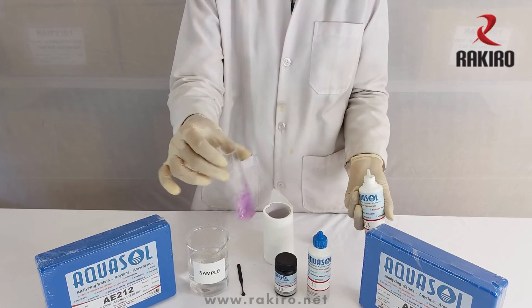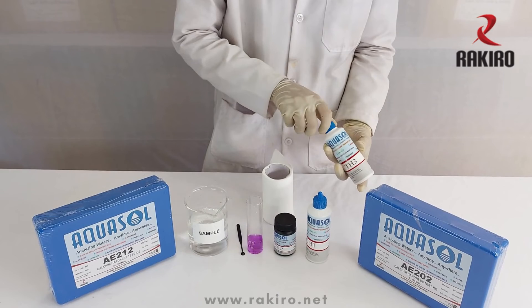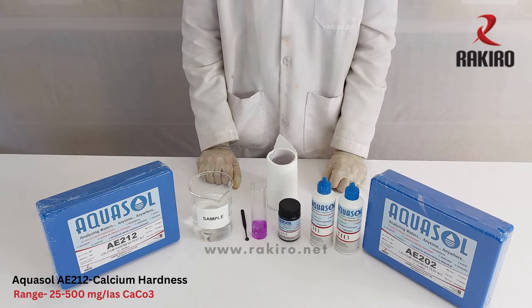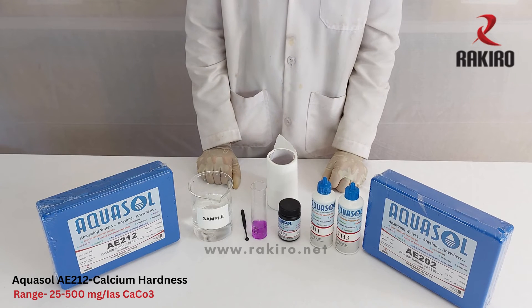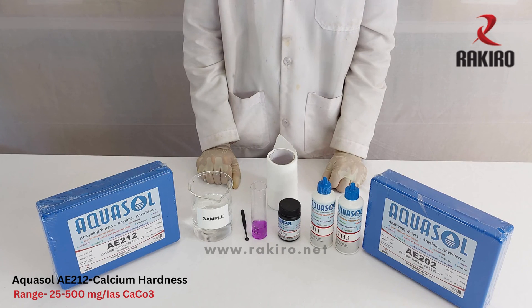Number of drops of TH3 reagent multiplied by 5 is the calcium hardness of the water in ppm. If the calcium hardness is more than 100 ppm in the sample, then use the Aquasol AE212 test kit. The range of this kit is 25 to 500 ppm of calcium hardness.